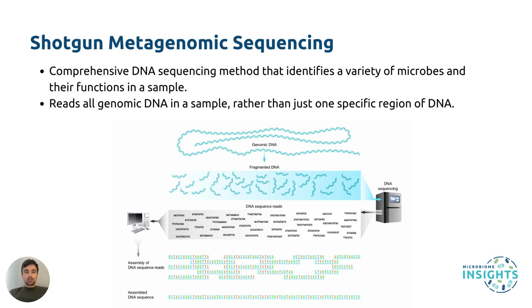Sequencing all regions of genomic DNA in a sample allows for a comprehensive analysis of microbial communities. This includes providing insights into both the identity and functions of microorganisms. Often, the genes within a microbial community can tell you much more than just the types of microbes that are there.